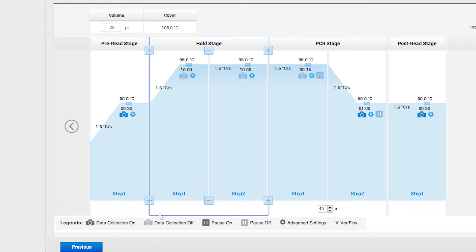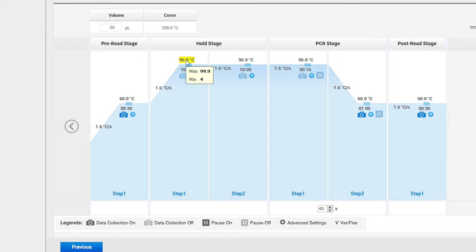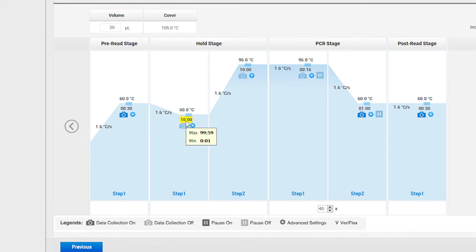This is your reverse transcription step. Set this step to 50 degrees by clicking on the temperature and typing in 50. The step's time should be 10 minutes.